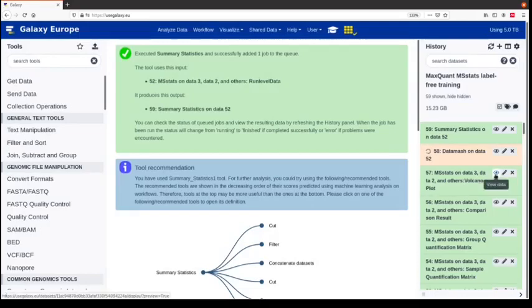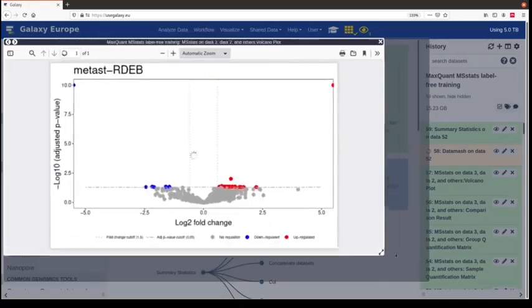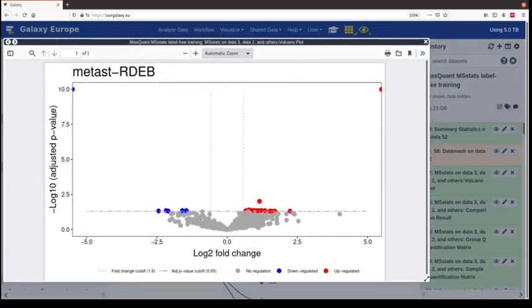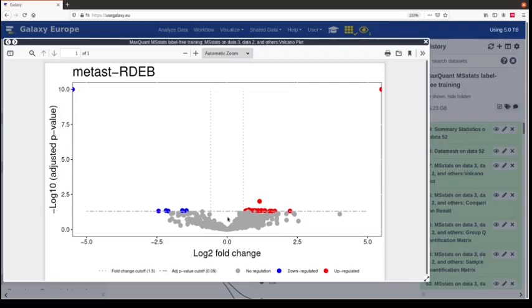The sample quantification matrix gives us the quantities for each condition — each sample and each protein. We have 19 columns, one per sample, and we get an abundance value for each protein. Then for each protein we also get a summary of intensities per condition. The comparison result is the actual statistical table containing the protein name, the label, the log2 fold change, and most importantly the adjusted p-value column. There's also an issue column — for example, a protein that was not measured at all in one condition will show 'missing in one condition'.